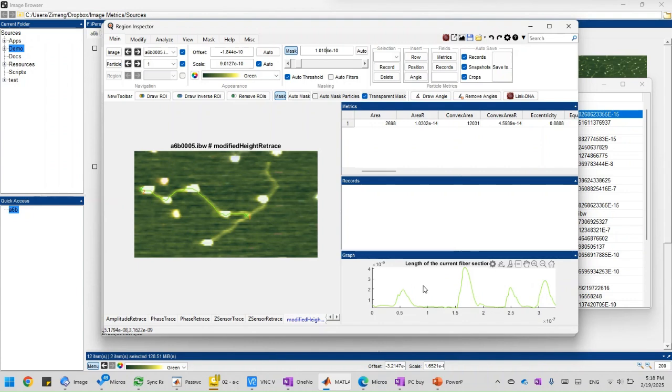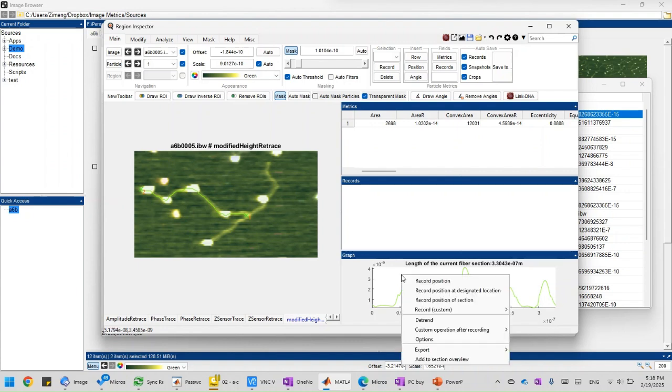And so now we want to identify the peak locations. Okay, so in image metrics we have a tool, and you can write a custom script to identify the peaks automatically for you. So that's the find peaks.